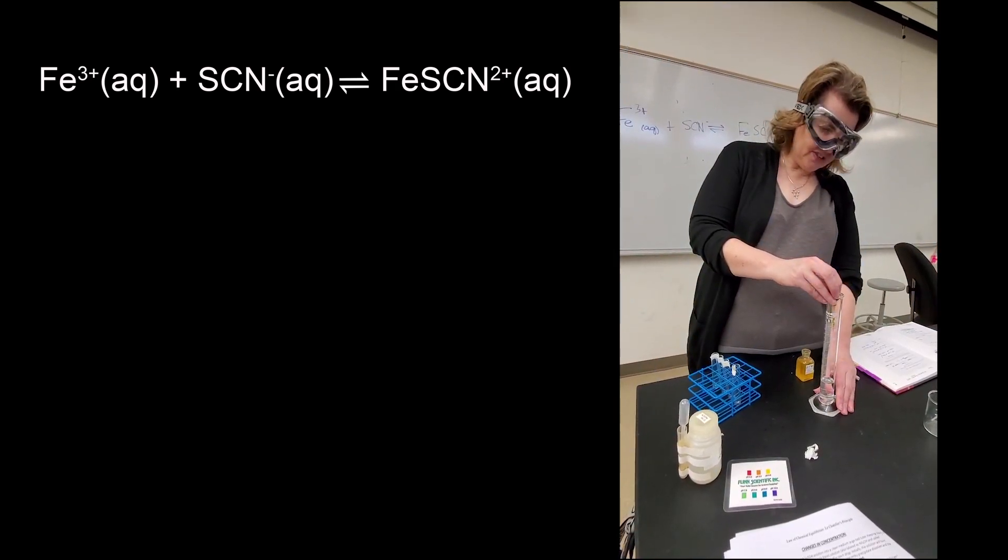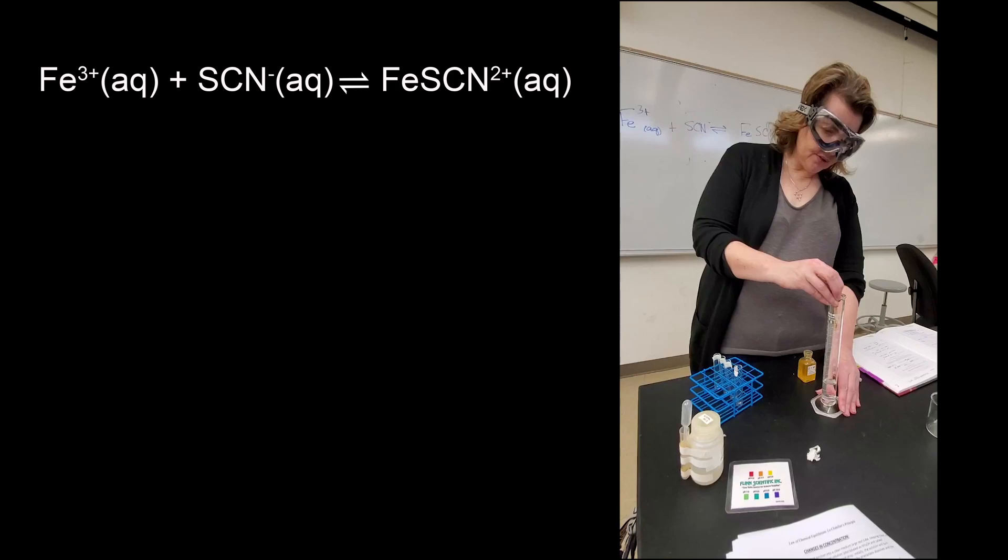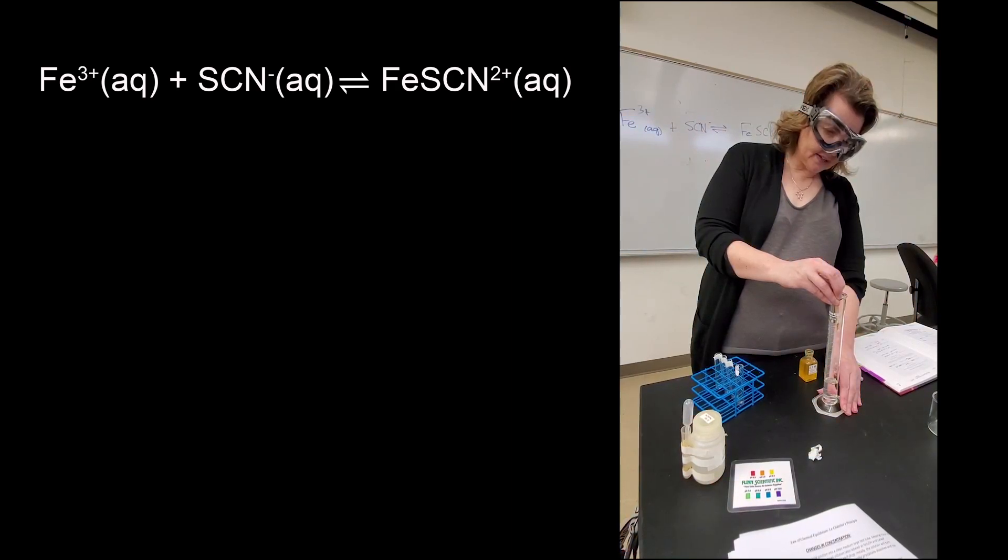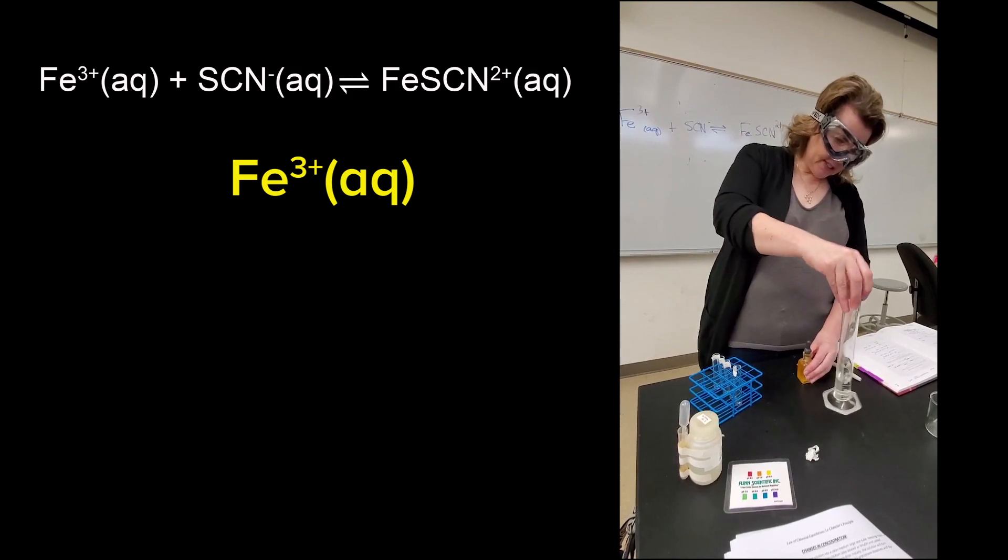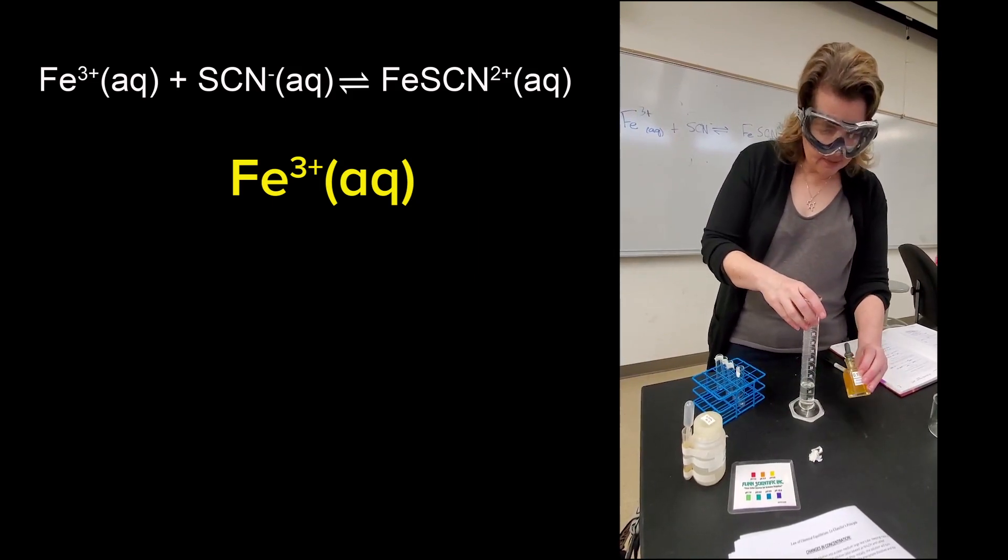This is the iron. So first of all, I want you to know that the color of this iron is yellow. One, two, three, four, five, six, seven, eight, nine, ten. Good enough. Very precise. Very precise.